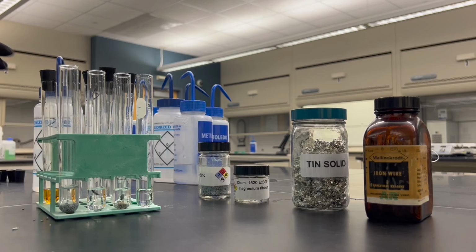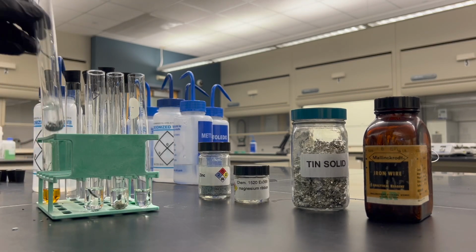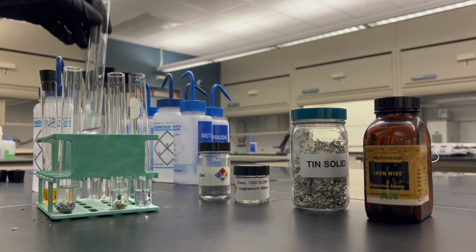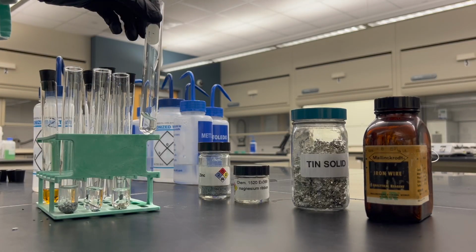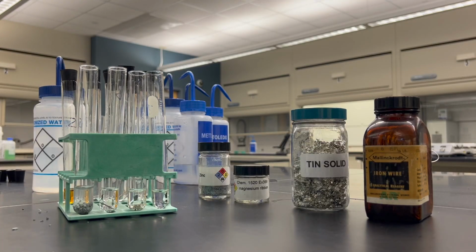Doesn't matter how much, and I'm just gonna swirl them around a little bit, just so that all the water is getting in there and it's fully submerged. Okay, and we're just gonna let those sit for a couple of minutes.